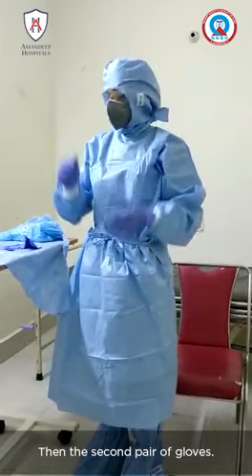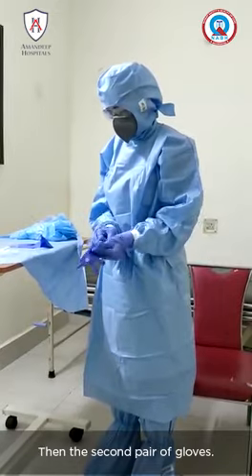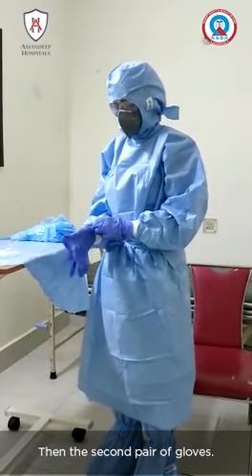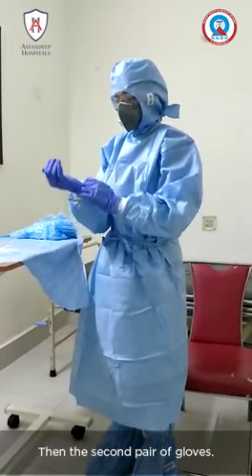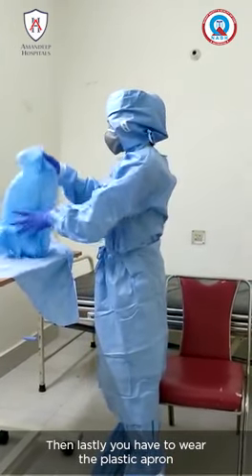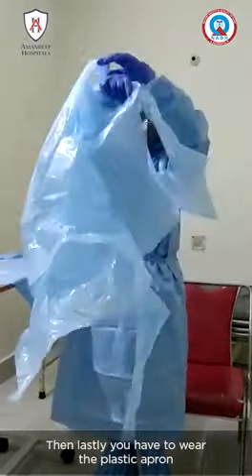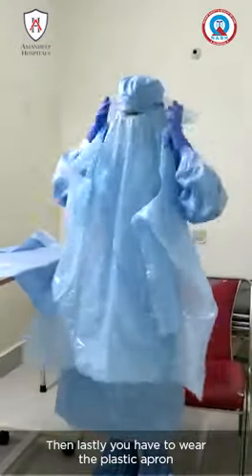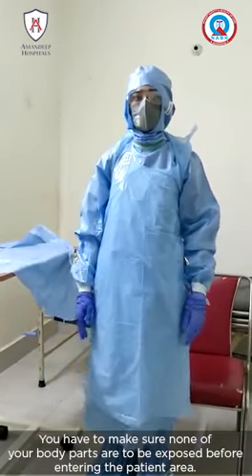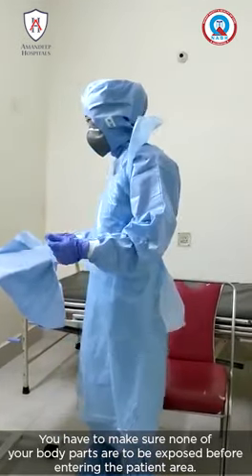Then we put on the second pair of gloves. Lastly, you have to wear the plastic apron. You have to make sure that none of your body parts are exposed before entering the patient area.